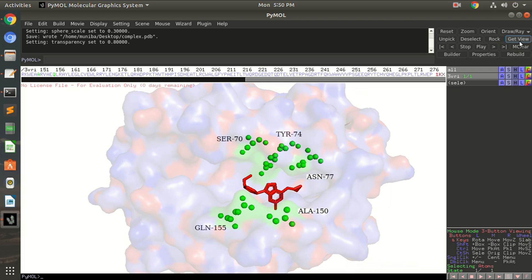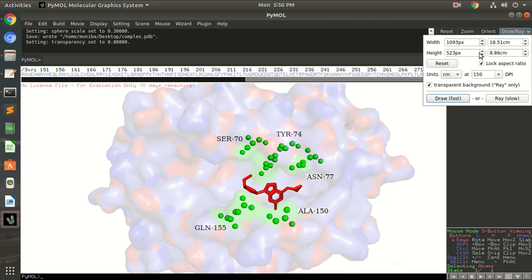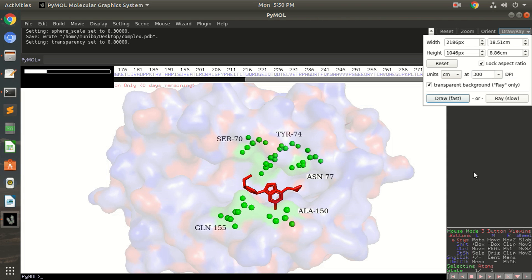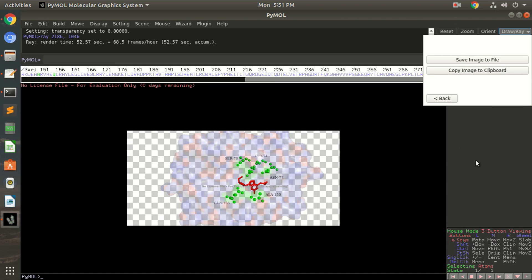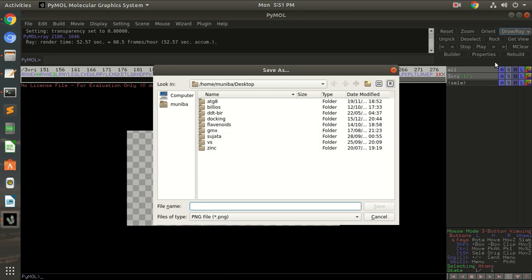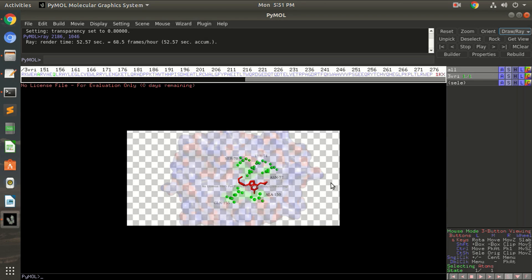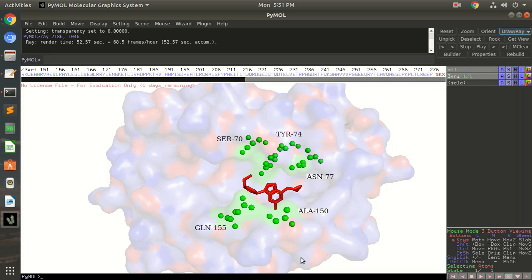Okay, and you can always save the picture in high quality. Always use ray at 300 dpi. You want to keep the transparent background then it's your wish. When you ray it, it will take a little while. Now save this image to file, image.png. Okay, now it's saved.